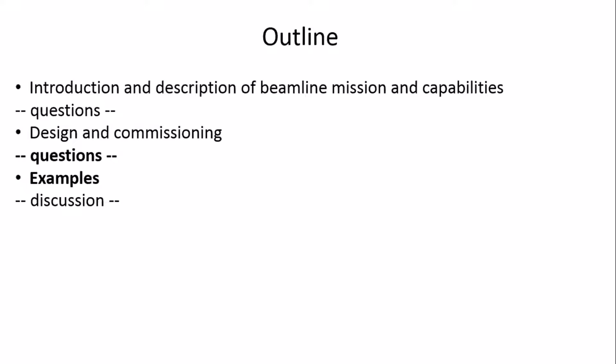Okay, so the question about the beam height as a function of quick scanning. This monochromator, we're actually using the X15B monochromator with a few modifications. That monochromator only has one motor driving the Bragg angle and crystal translation. So it is synchronized. Aha. So it's a linkage. Yes.